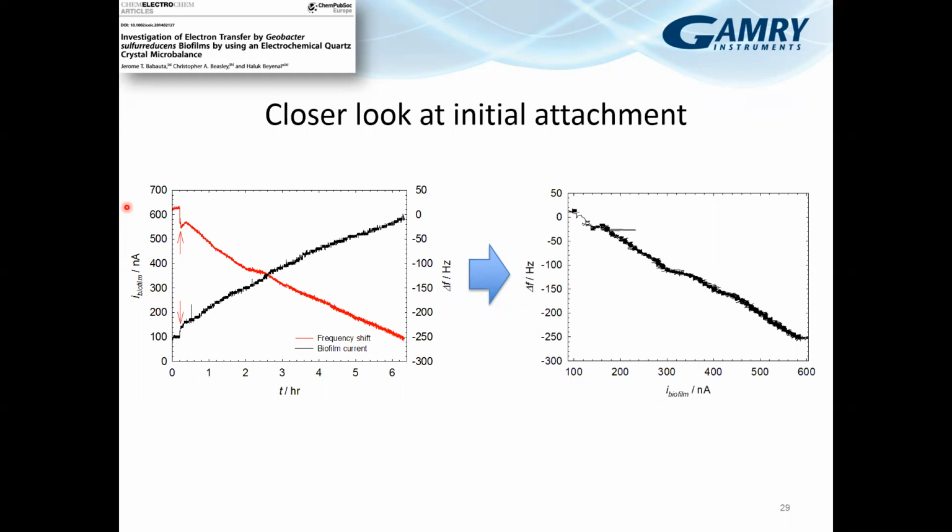And then your second question was? The second question was how to prevent external vibration from being recorded in the signal. The particular cut of the quartz is an AT cut. It's a thickness shear resonance, and that is, it's a weird.